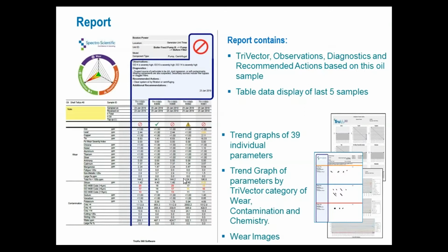It's lab quality data. The important thing from an operator or a flow is really, at first look, you're looking at the report, the items within the solid blue lines here. Gives you the overall alert, alarm, or normal indication here, green, yellow, red, which we'll see. Automatic observations, which are based on the parameter measurements and the limits. And then again, diagnostics and recommended actions from our default software, diagnostic sets, and other recommended actions that your operator can enter.